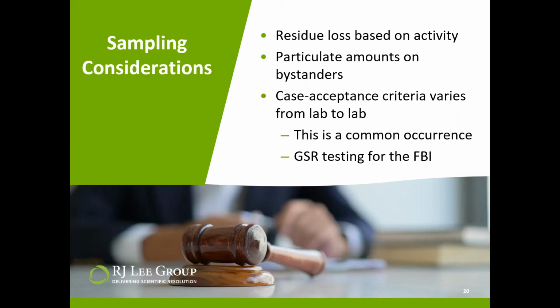Okay, just a few other sampling considerations. As an investigator, a technician, or simply a person who might be collecting GSR samples, there are certainly things that you should consider when you're contemplating what items would be the most probative items to test for GSR. Remember that the number of particles that are collected and the amount of particulate loss vary widely from case to case with the activity of the subject.